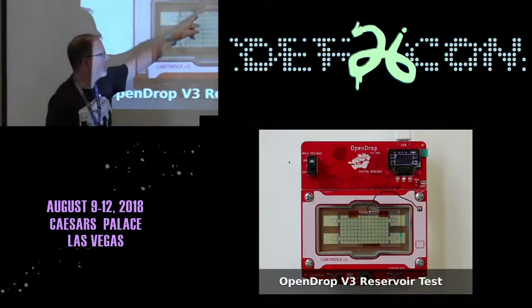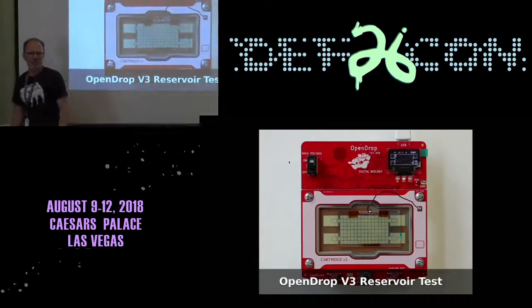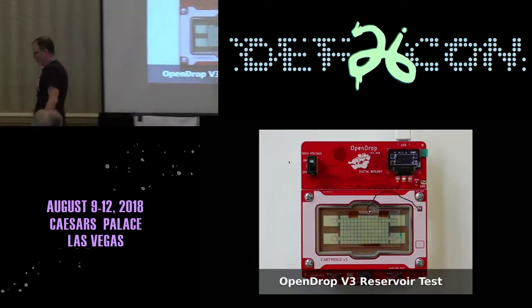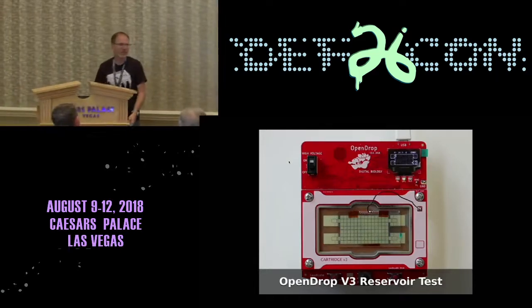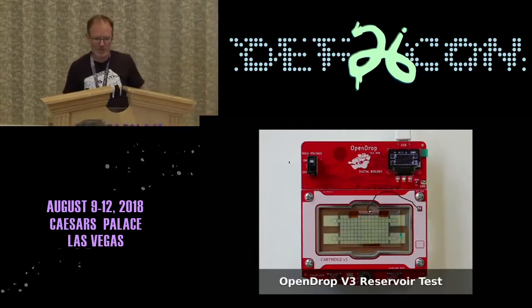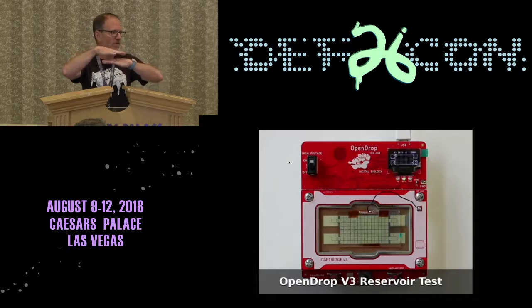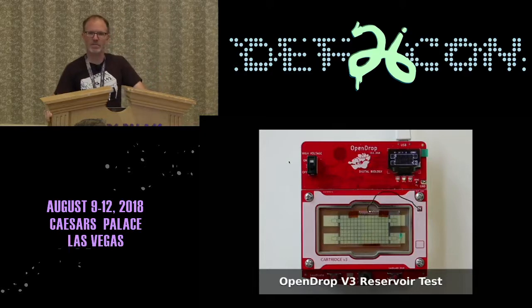And you can see the wire here. He's grounding that. One of the things that you need to do is remove any static charge from your droplet in order for it to work. So in this case, he's using what looks like Kapton tape or something like that to separate the top glass from the hydrophobic surface. So he's got a droplet that's in between there.